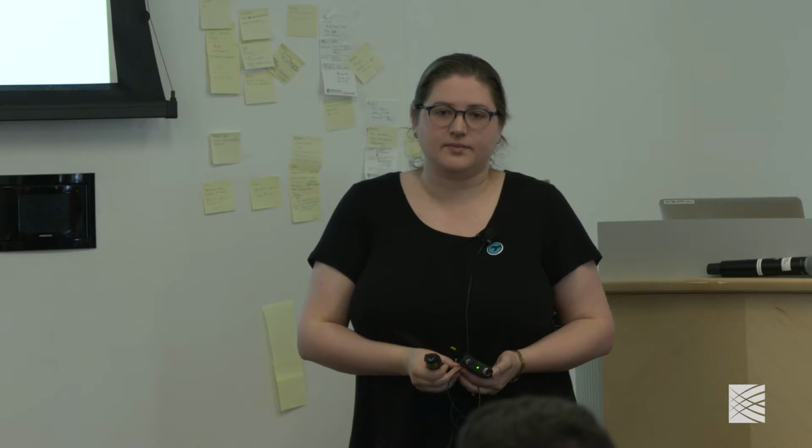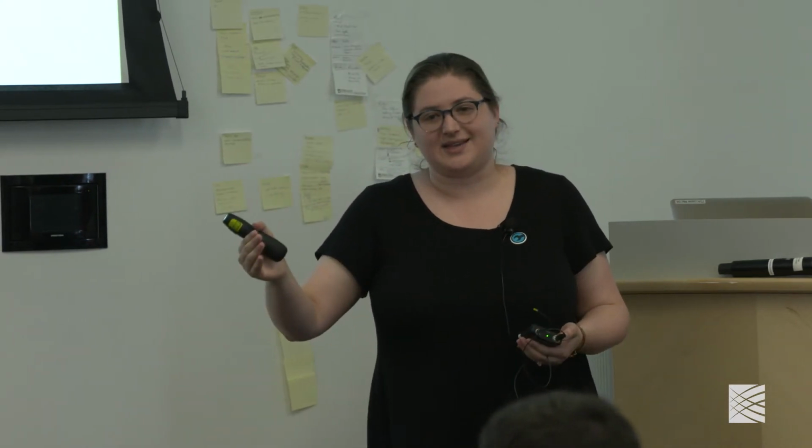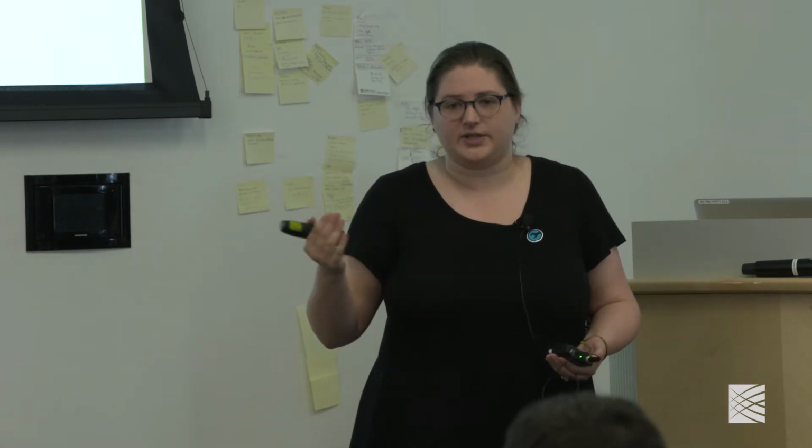Do you guys have a panel of normals that would sort of be a standard set that people frequently use? Yes, I believe that if you are getting your sequencing done at the Broad, we would be able to provide that. I think we have that. If you're doing sequencing somewhere else, then you should really try and use as close to that technology as possible. You could still use a panel of normals provided by the Broad, but it might not be as effective because the artifacts will look different.